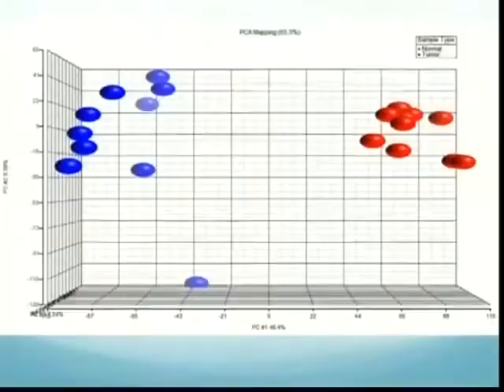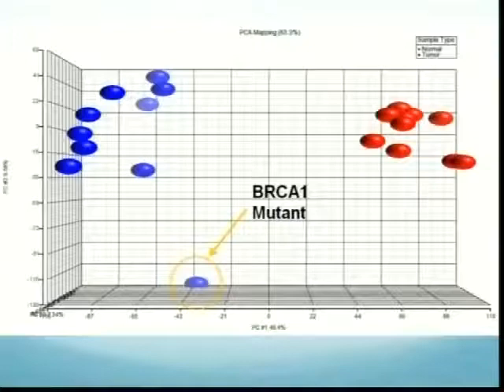Oh, and just to show, based on that gene expression platform I showed you, when we did the analysis, it was interesting. We always had this one sample, and for 2 years, we never knew why the sample was away from the group until we did the mutation analysis, and this one's actually a BRCA1 mutant, which separated itself from the rest of the pack.